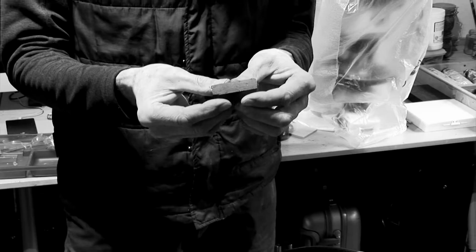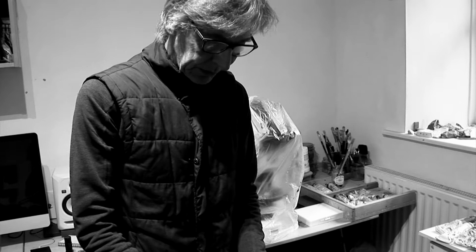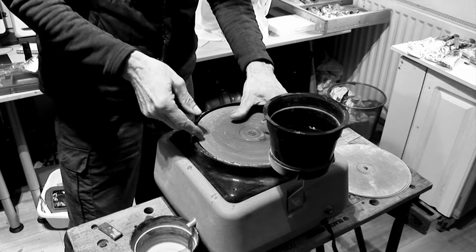So you can actually see now the little bits of ash that have made up the rock. So I'm going to change it now from this fairly coarse wheel to a finer one. Get rid of any scratches.